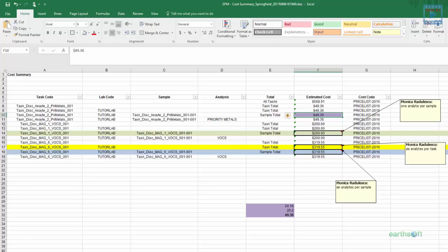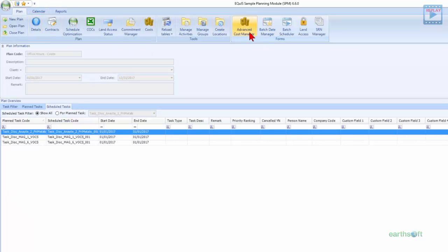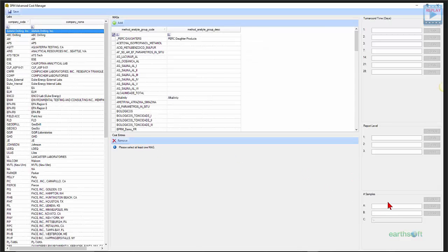There is one question from Carl, and he asks, what is a cluster? Is this a new concept in SPM or another term for MAG? I think that came up first on slide 3. Yes. No, I guess it's my creativity talking about clusters. It's not a new concept. I do apologize for that. Cluster is just me organizing my thoughts. In my mind, the cluster was basically, and it's not a new word, absolutely, this number of samples that they group together for a certain price. Excellent. Okay.